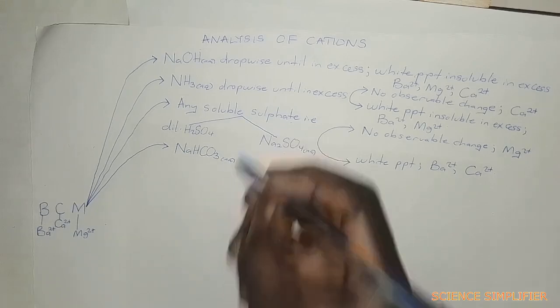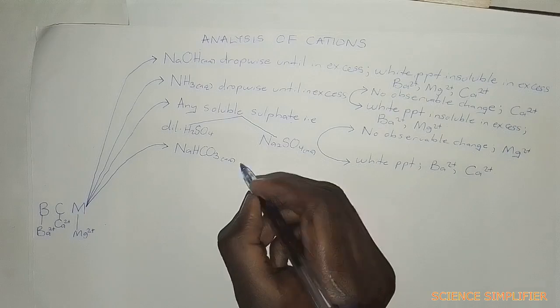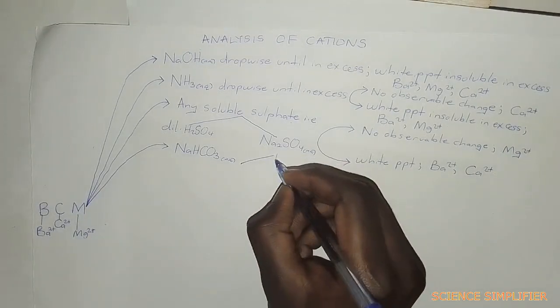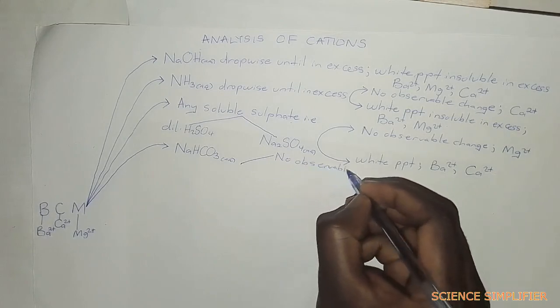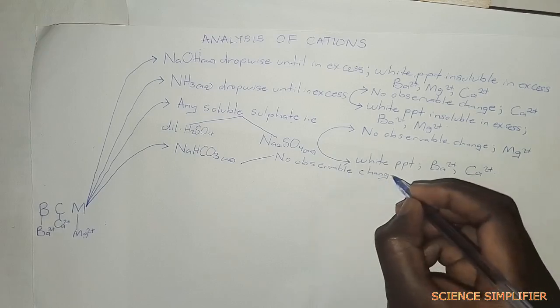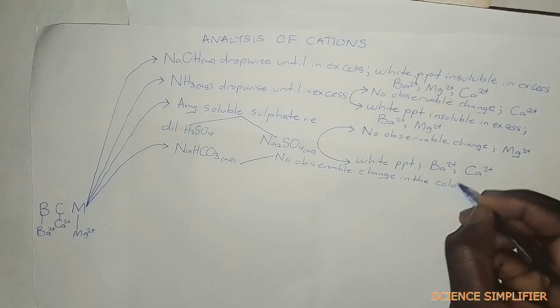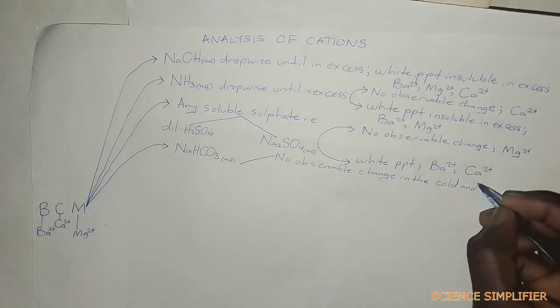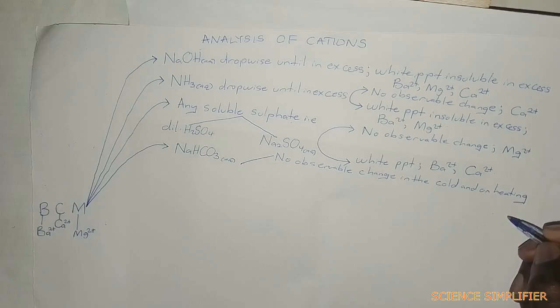The moment you add sodium hydrogen carbonate solution and we obtain no observable change, no observable change in the cold and on heating, just know you are dealing with barium ions.